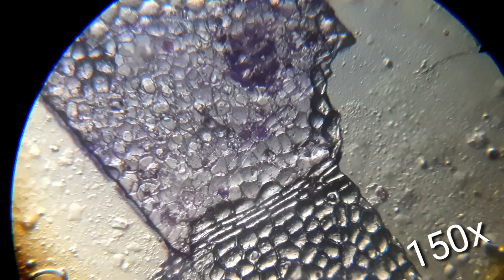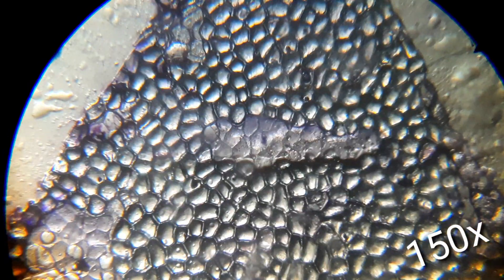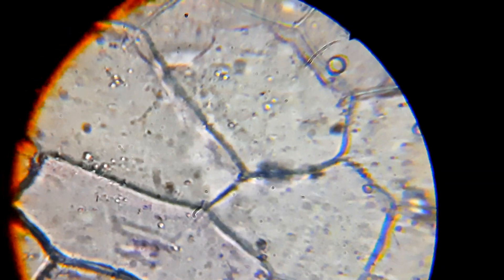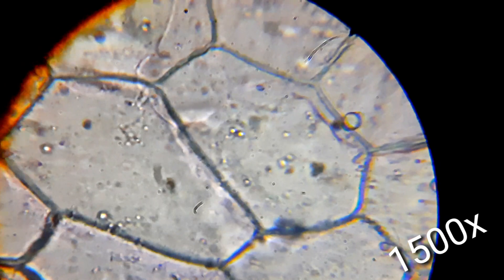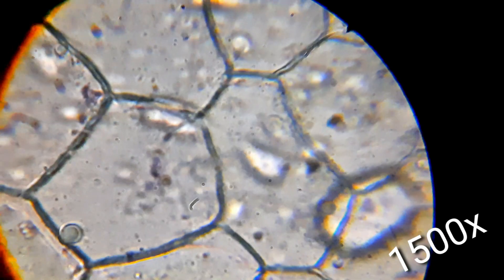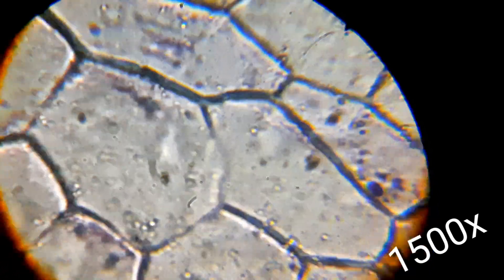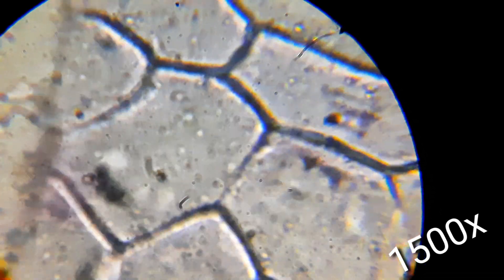This is all going on at 150 times magnification. The stain is clogged up a little bit, and as you can see the double-walled cell walls of the plant cells are visible over there. At 1500 times magnification, if we had a better sample we should be able to view the cell organelles — not exactly the mitochondria, but we could view the chloroplasts and maybe some other moving protein components.